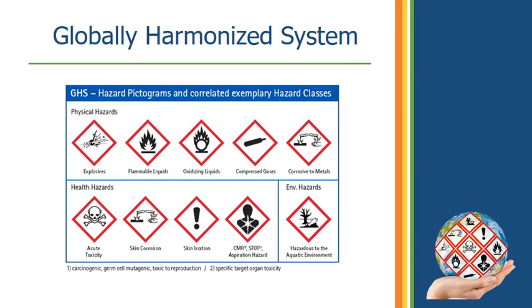There is also an OSHA quick card that compares the NFPA Diamond Labeling System to the HAZCOM 2012 or GHS Labeling System — they are one and the same, as OSHA incorporated the GHS and now calls it HAZCOM 2012. I want you to be familiar with this one. Note that the NFPA Diamond uses numbers from 0, which is almost no risk, to 4, which is the most risk — whereas the GHS numbers are opposite, with 1 being the highest risk and 4 being the lowest risk.